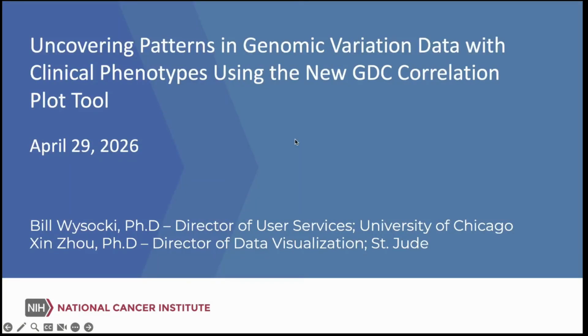My name's Bill. I'm the Director of User Services at the University of Chicago. And today I'd like to present to you uncovering patterns in genomic variation data with clinical phenotypes using the new GDC Correlation Plot Tool. I'm here with my colleague Shin. I'll let him introduce himself at his section, but we will get started.